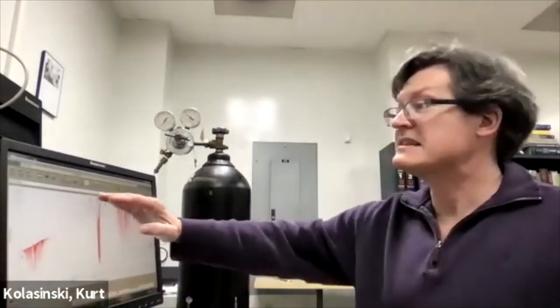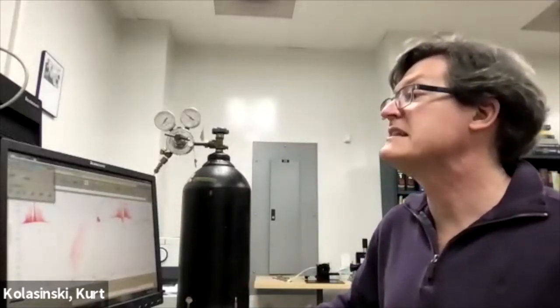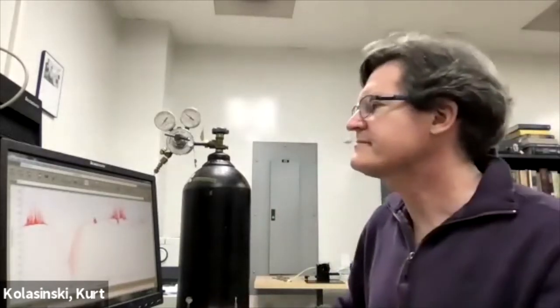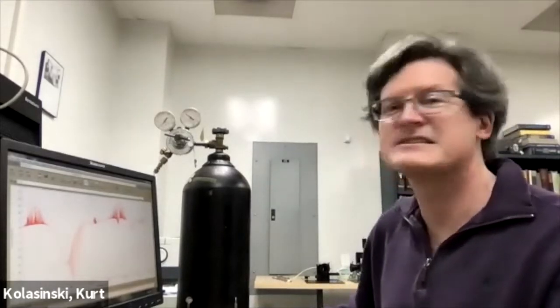That's the background. Now, we would have expected the infrared light from the glow bar to be just a broad featureless spectrum of light. You can see there's all kinds of structure in there. And that was with nothing in there. All that was in there was the cell. And we still had stuff all over the place. Now I've got things going up, things going down. This is kind of crazy.